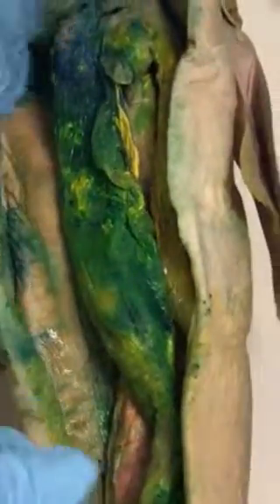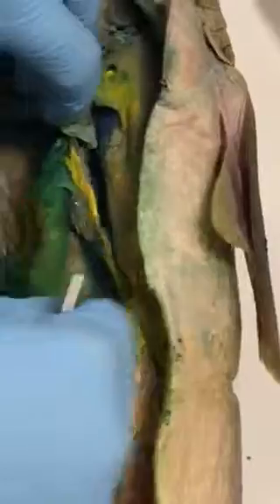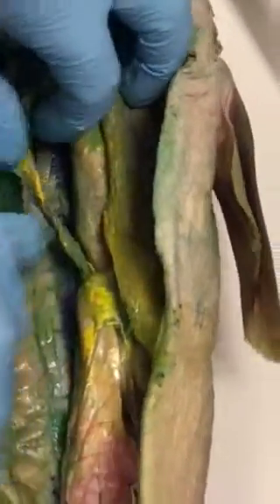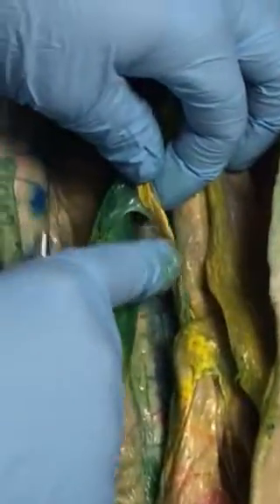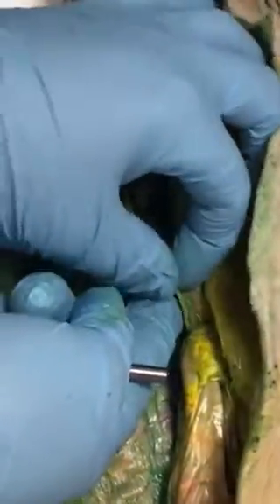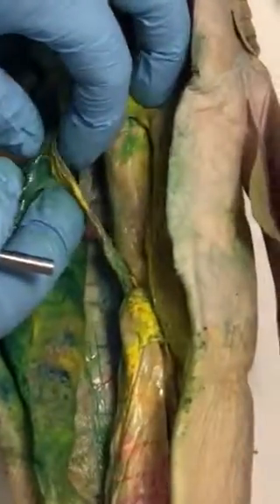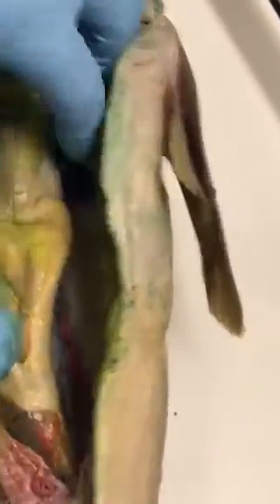Okay, pancreatic mesenteric artery. What's the next one down from that? Hepatic. Okay, so the hepatic is this yellow one, and then the greenish blue, gray one that's kind of twisted with it is the pancreatic mesenteric. But they're not always going to be the same color in a different shark, necessarily. These two that are twisted together go into the mesentery, and then the pancreatic, the other one, they both kind of go up to the liver here.